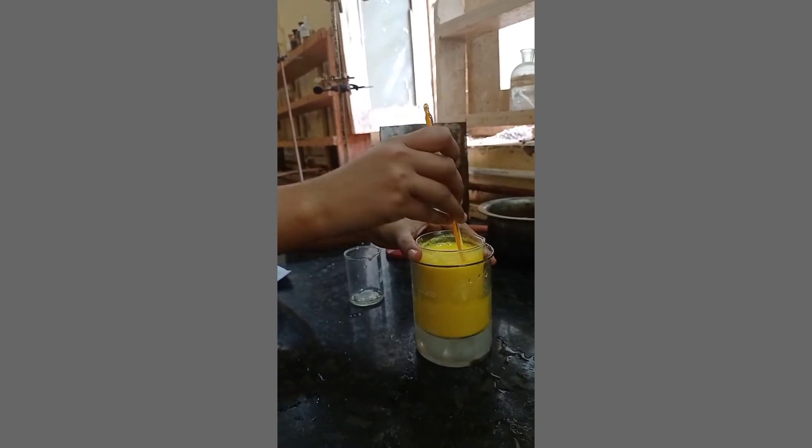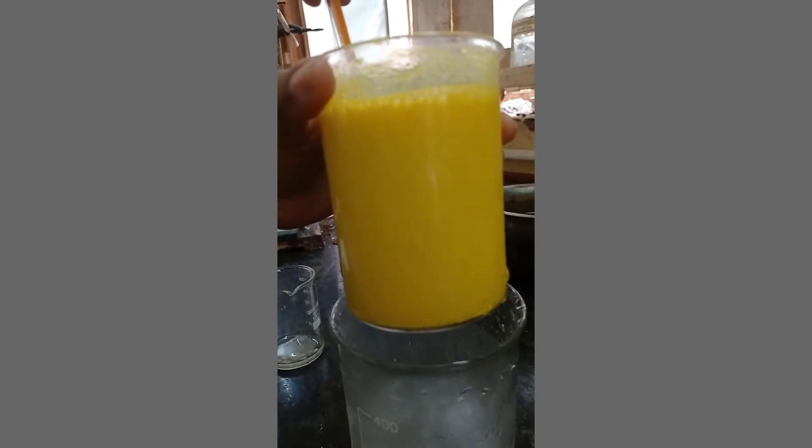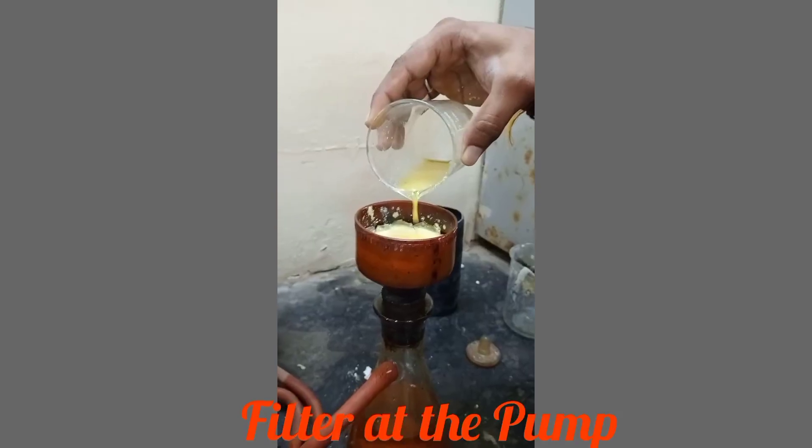Stir gently and make sure that precipitation is complete. Then filter the reaction mixture using a pump.